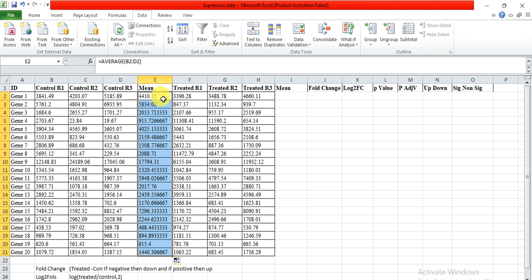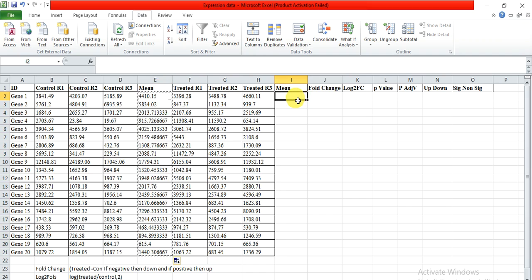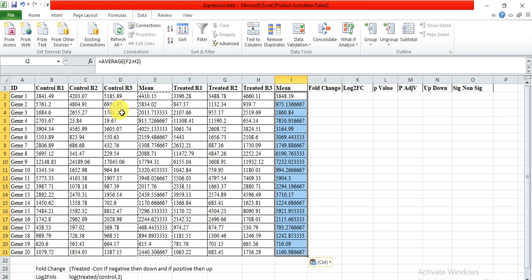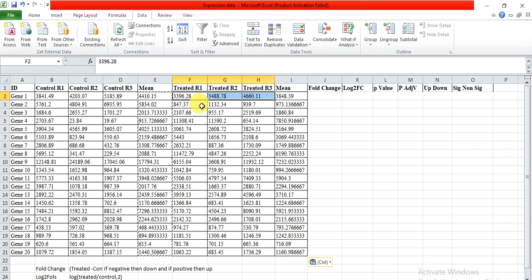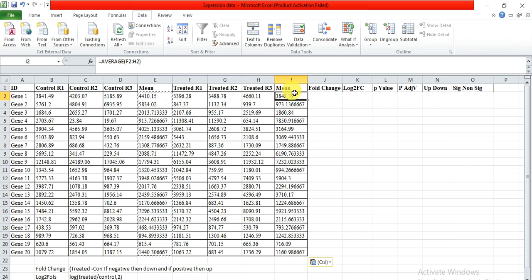Simply select this entire column, copy with Control+C, then click here and paste with Control+V. That formula is pasted in this column and it has the mean value of these three replications. So we have the mean value of control and the mean value of treated samples.